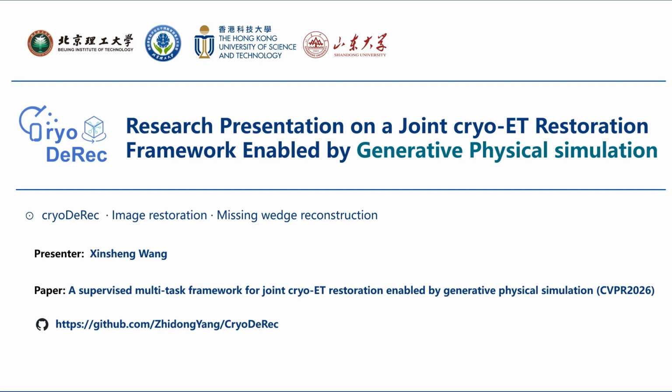Good morning everyone. Today I will present the paper, A Supervised Multitask Framework for Joint Cryo-ET Restoration Enabled by Generative Physical Simulation. The proposed method is called cryoDeRec. It focuses on two major degradation problems in cryo-electron tomography reconstruction, low signal-to-noise ratio, and the missing wedge caused by limited angle acquisition. The main goal of this work is not only to denoise cryo-ET tomograms, nor only to recover the missing wedge. Instead, it aims to perform joint cryo-ET restoration in a unified framework.